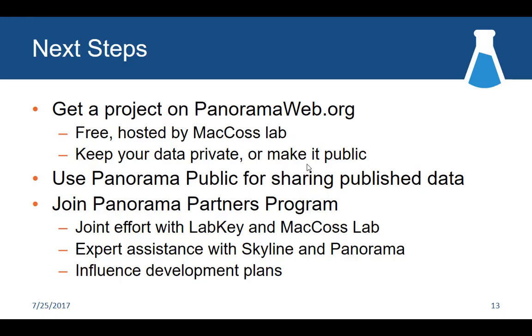So next steps, I suppose the next step is to listen to the next presentation, which will go into more detail, but getting a project on that Panorama web server I was just showing a moment ago is probably the easiest way to start kicking around. And I think everyone has at least a trial account for use here in the course. Like I said, you have control. Is that data private? Is it public? Kind of who can access that?